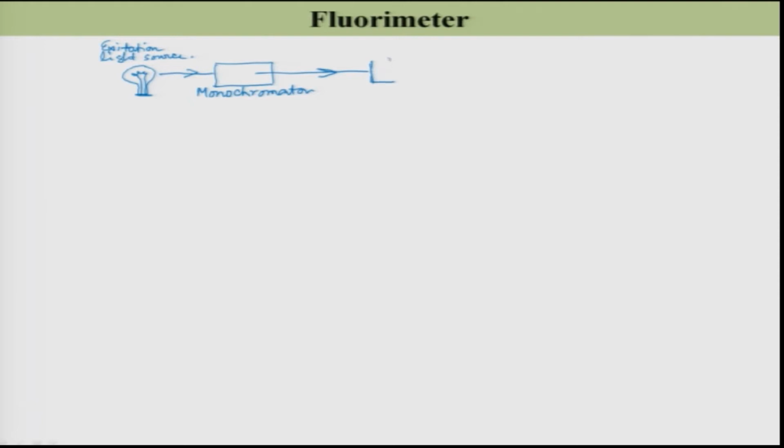and you are going to excite your sample. Here is your sample. Upon excitation the molecule will go to the excited state.